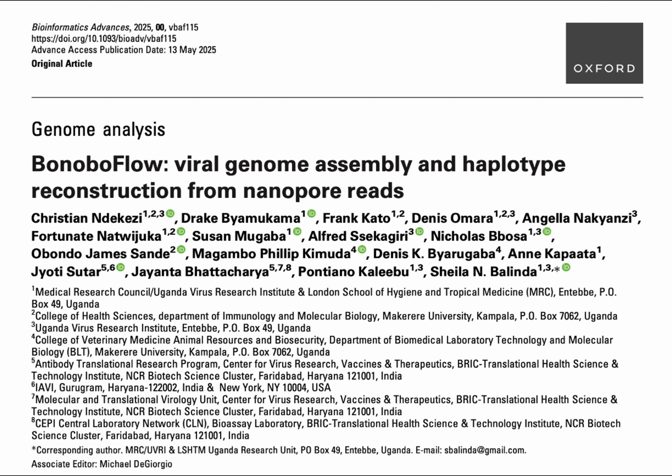They simulated sequencing reads from several different viruses: Zika, polio, adenovirus, HIV, even the large vaccinia virus. They simulated them with a fairly challenging 10% error rate, so 90% accuracy, and a decent sequencing depth of 100x. And how did BonoboFlow do compared to other tools? Well, BonoboFlow, along with some other established pipelines like StrainLine and Accuvir, generally performed very well. For many of the viruses like polio, HIV, adeno, Zika, they typically showed alignment percentages above 99%. Pretty good reconstruction.